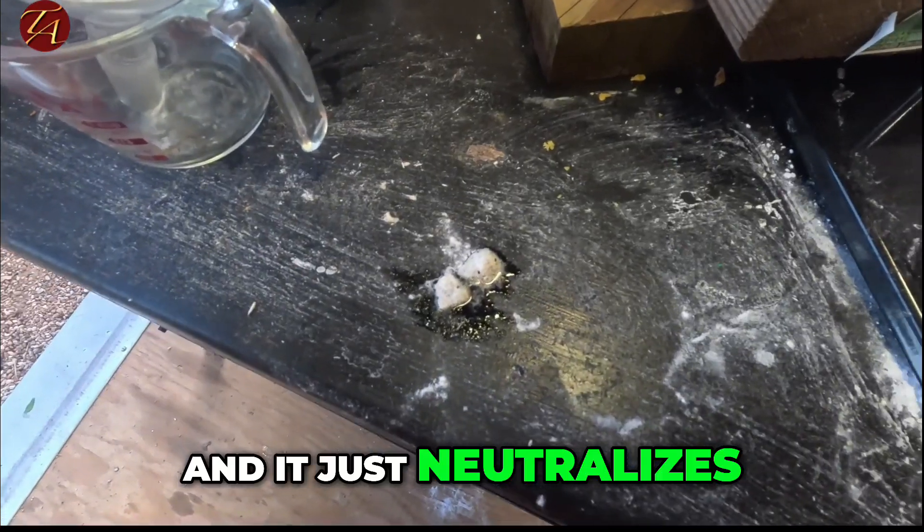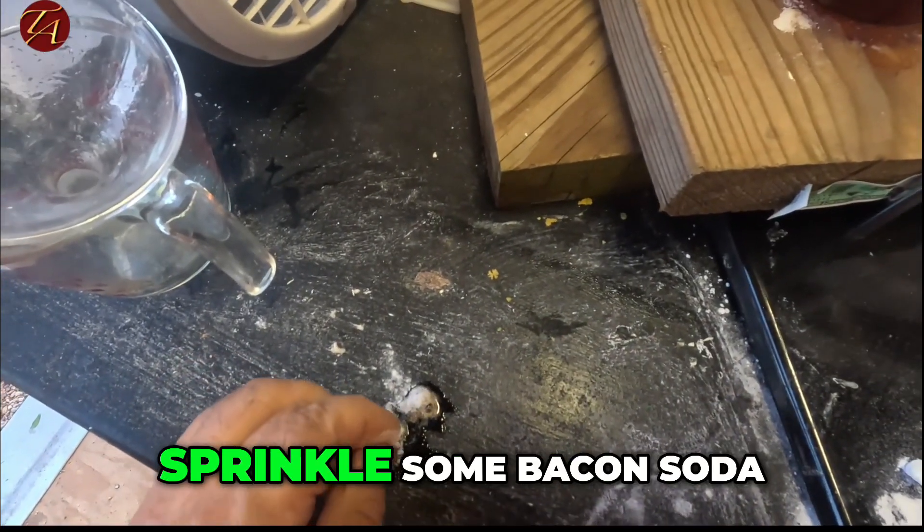It just neutralizes the spill when you sprinkle some baking soda on it.